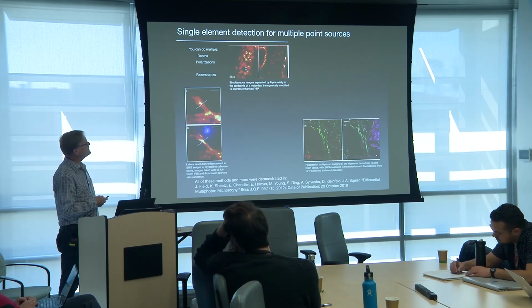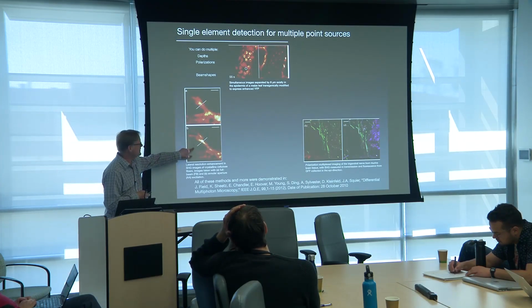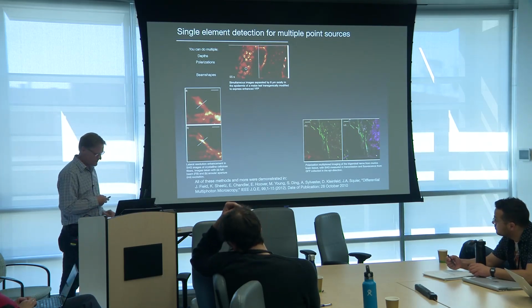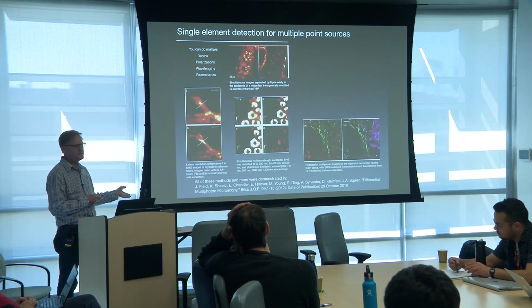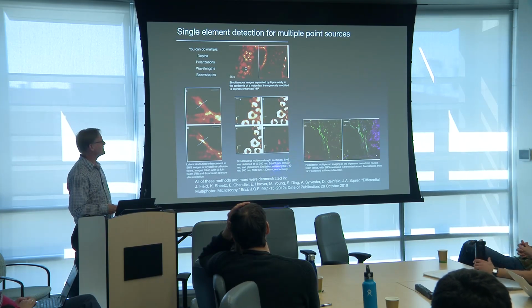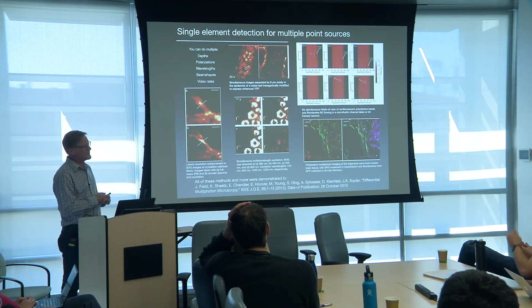Believe it or not, by playing around with the beam shape in one arm relative to the other, you can already start to do enhanced resolution. So here's the normal resolution of the microscope, and then by playing with the beam shape, you can already resolve things much better in this system. And if you look at the lineouts, this is what gave us about a factor of 2 enhanced resolution. It was fun to put photonic crystal fibers in one of these arms, and now this is doing multiple wavelengths all simultaneously. So we're at 900 nanometers, 1040, 1200, and 740 nanometers kind of simultaneously.